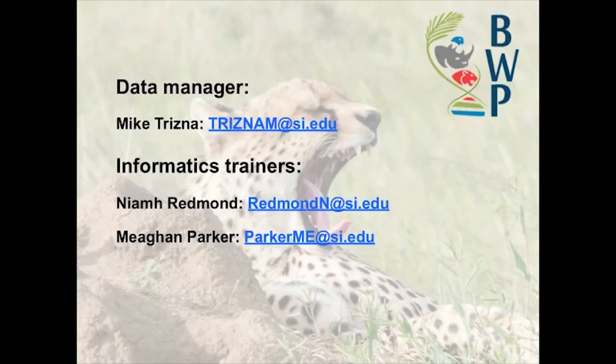This brings us to the end of our tutorial on validating and uploading your BWP FIMS spreadsheet to the FIMS database. Please do not hesitate to contact us if you have any further questions regarding the information in this video.